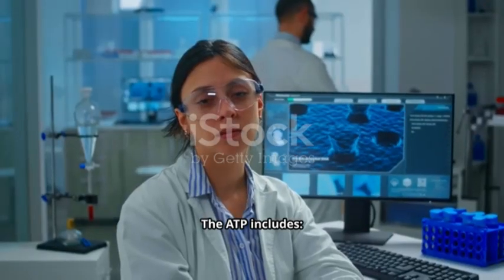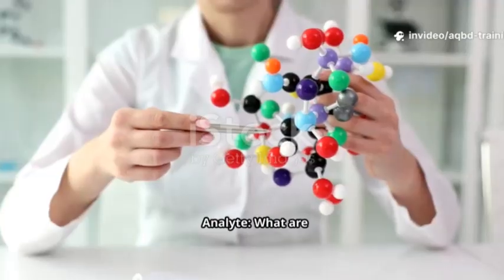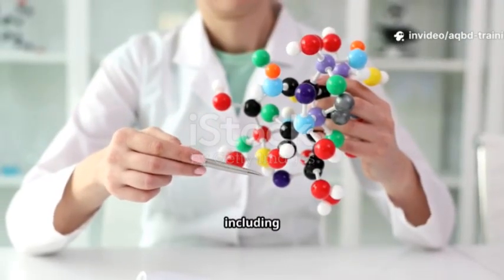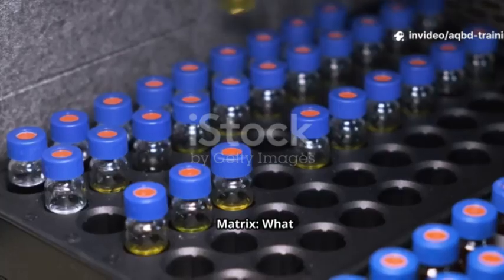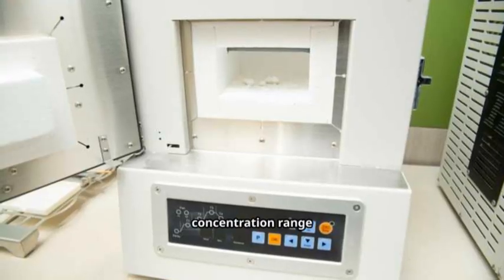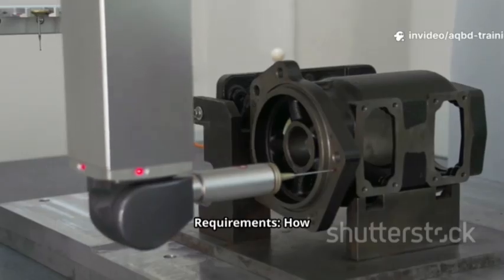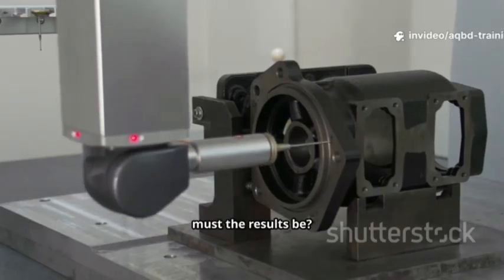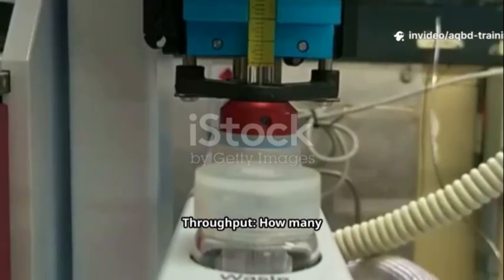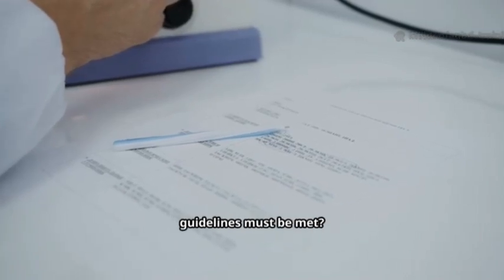The ATP includes purpose. What question is the method answering? Analyte. What are we measuring, including structural information? Matrix. What sample types will be analyzed? Range. What concentration range must be covered? Precision and accuracy requirements. How precise and accurate must the results be? Sample throughput. How many samples per day? Regulatory requirements. What guidelines must be met?